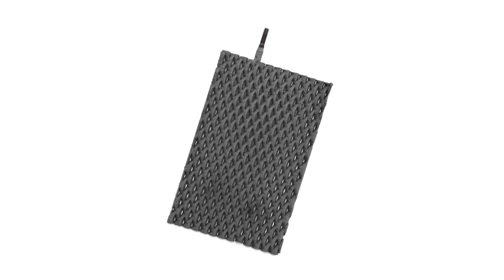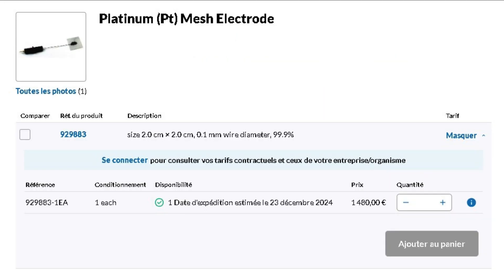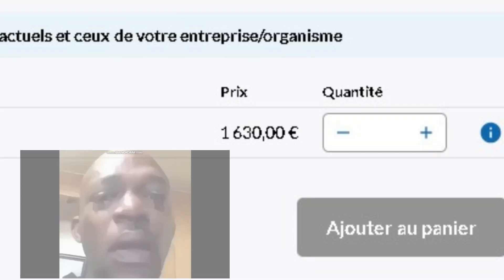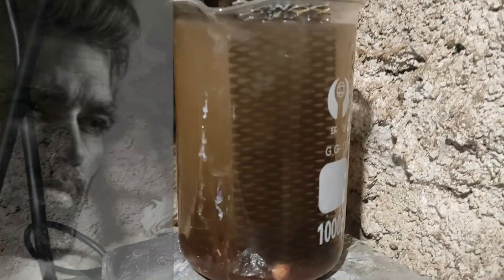Lead dioxide electrodes are one of the best electrodes you can have as a home chemist. They are incredibly robust, and one of the few that allow forming the perchlorate ion. The only main others are platinum and boron-doped diamond, but all of those are very difficult to obtain and quite pricey. So in this video, I'll try to showcase to you how you can make your own lead dioxide electrode.